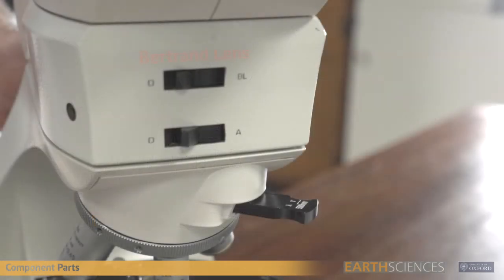Additionally, between the binocular viewing tube and objectives is the Bertrand lens, analyzer and wave plate.